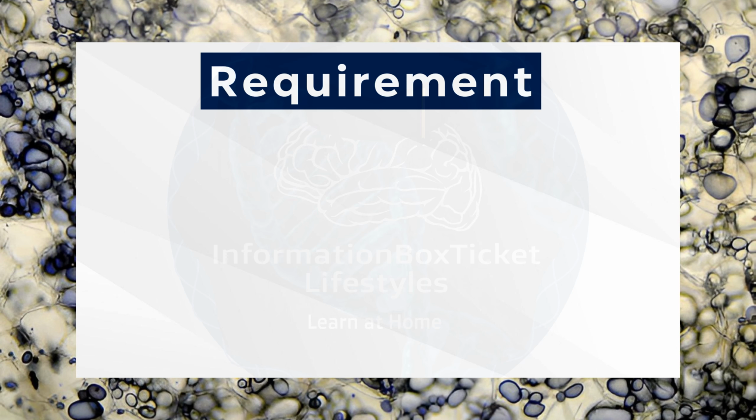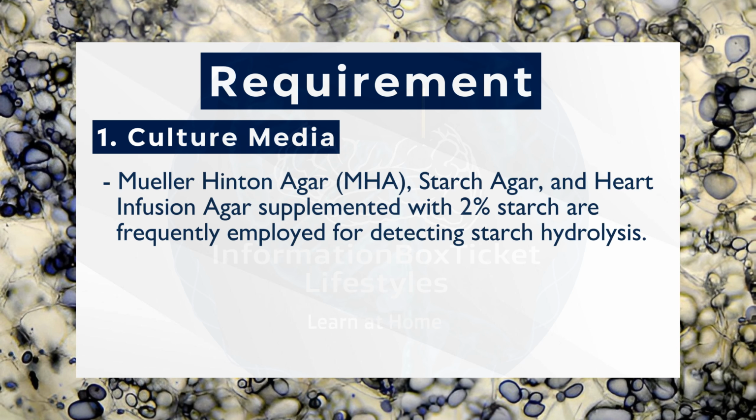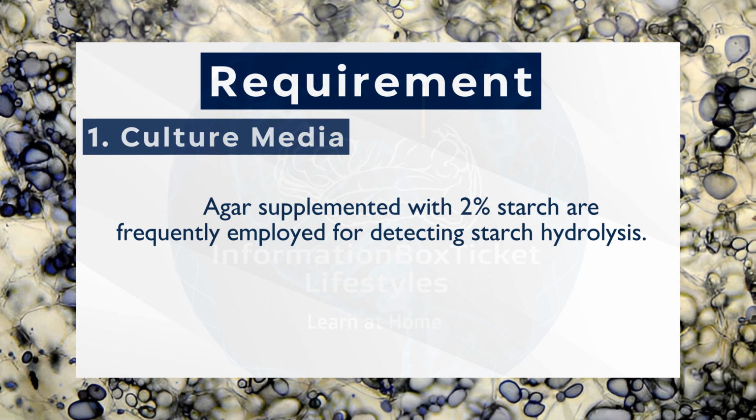Requirement for Starch Hydrolysis Test. 1. Culture media. Müller-Hinton agar, starch agar, and heart infusion agar, supplemented with 2% starch, are frequently employed for detecting starch hydrolysis.